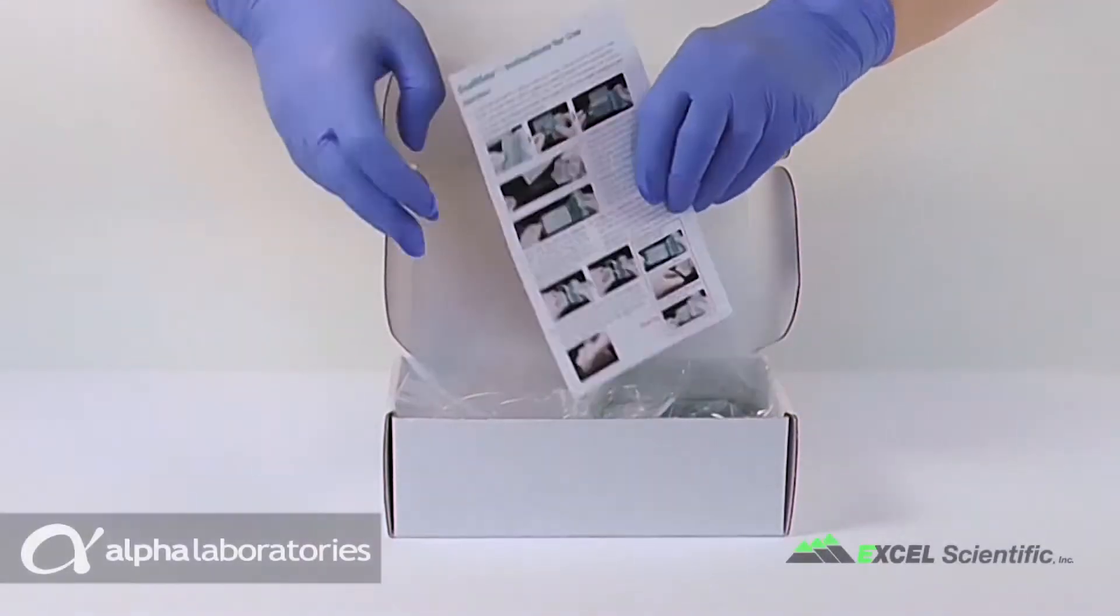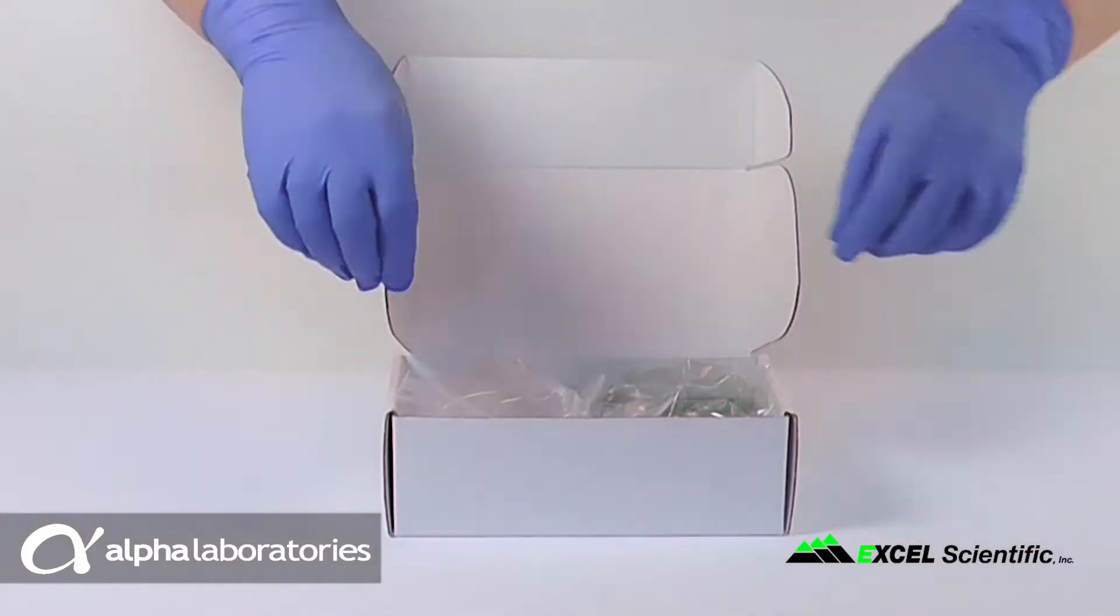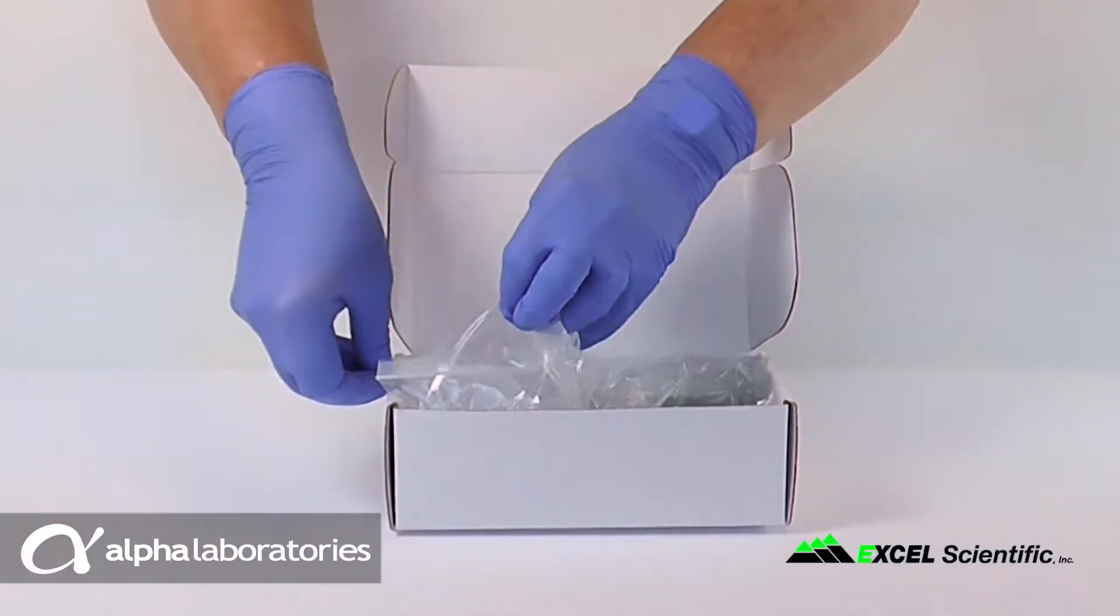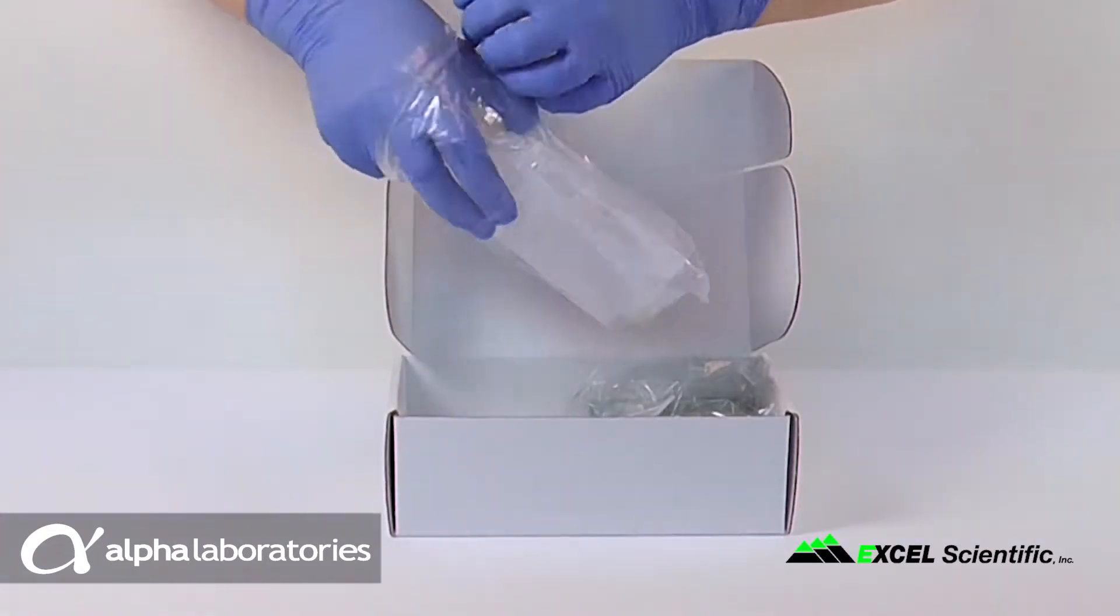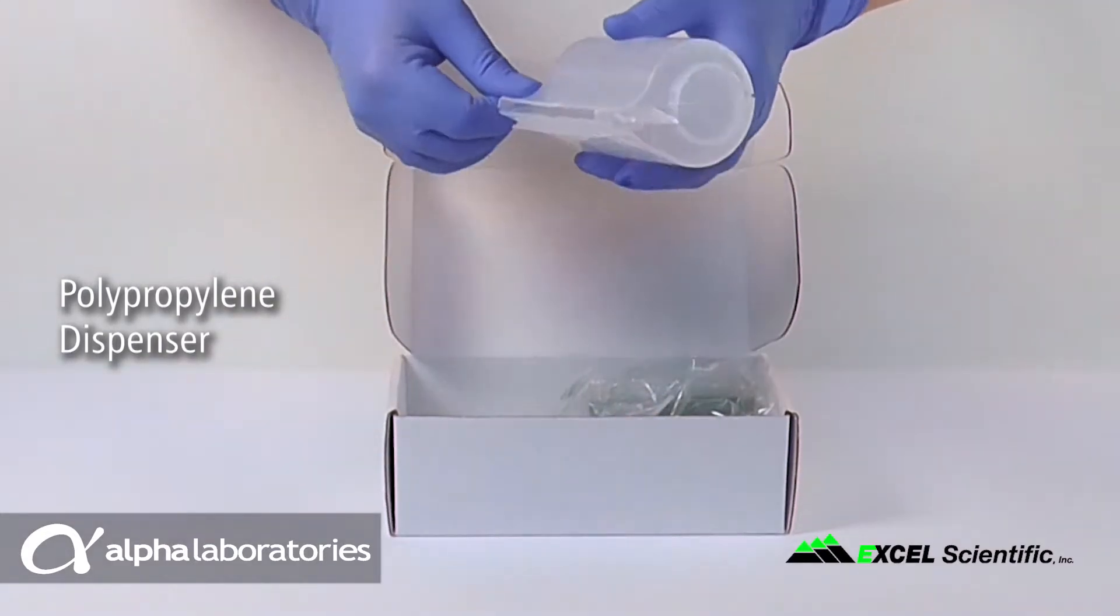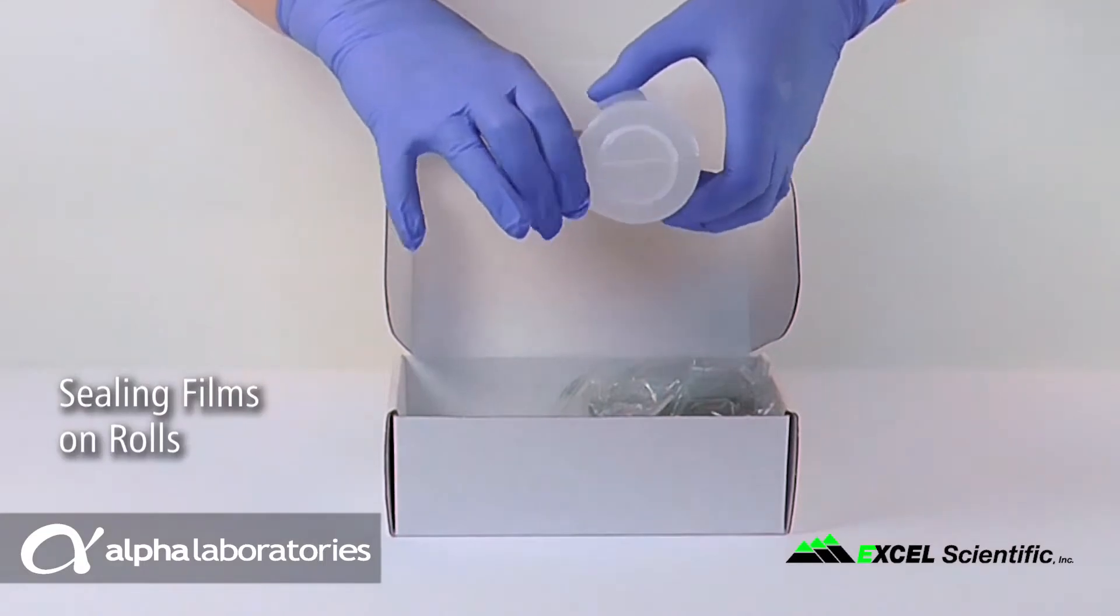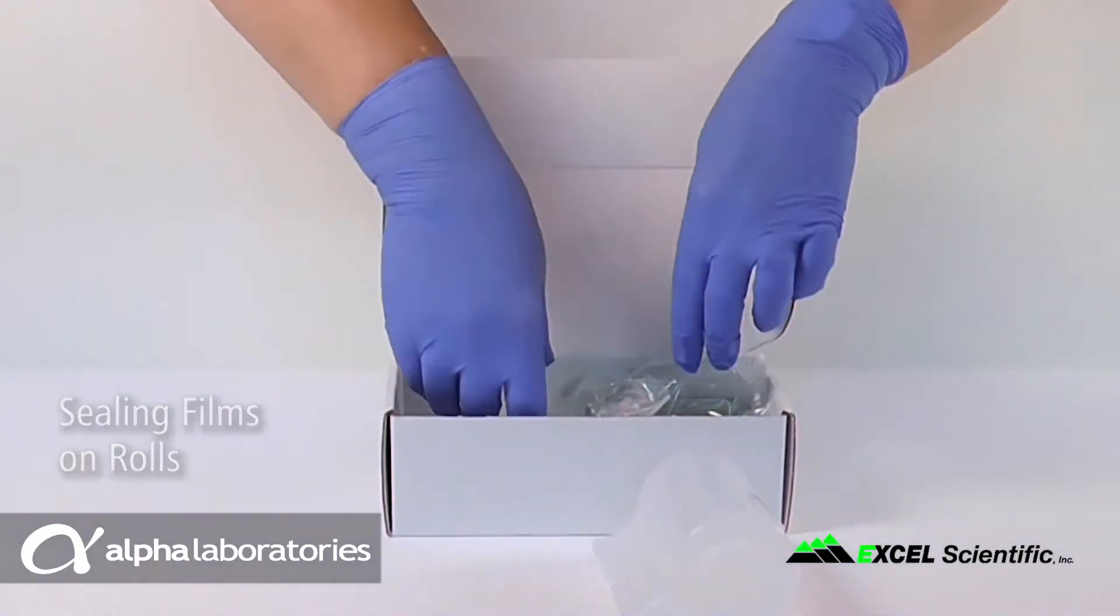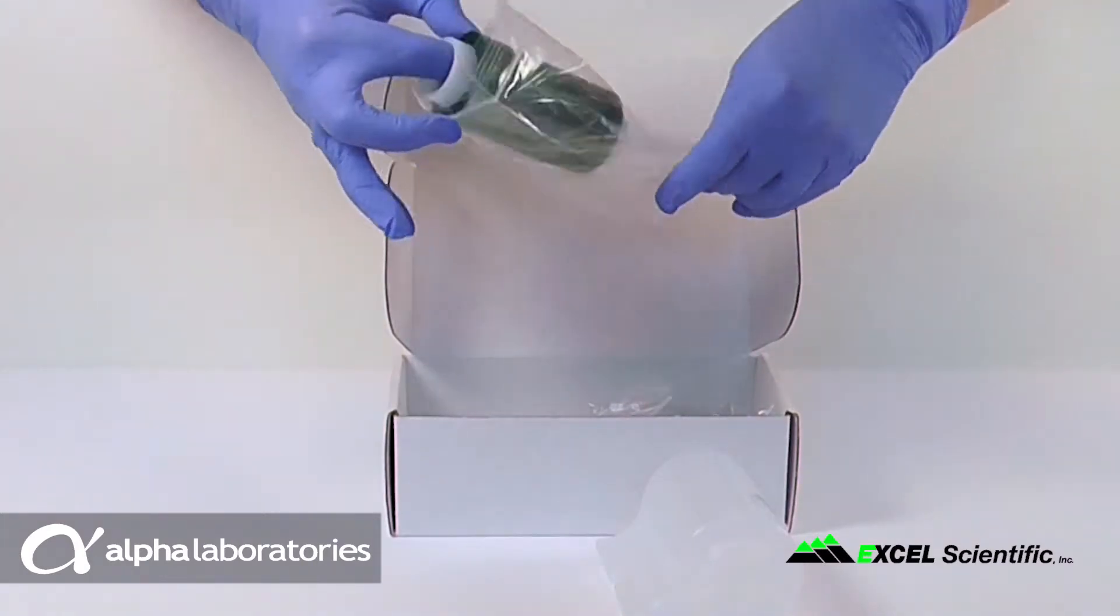XL Scientific's unique SealMate system provides a convenient new method for sealing standard format microplates with adhesive films. The system includes a molded polypropylene dispenser with a hinged clamshell design plus sealing film supplied in a novel sheeted roll configuration. The rolls are structured products with individual sheets separated by colored bands.